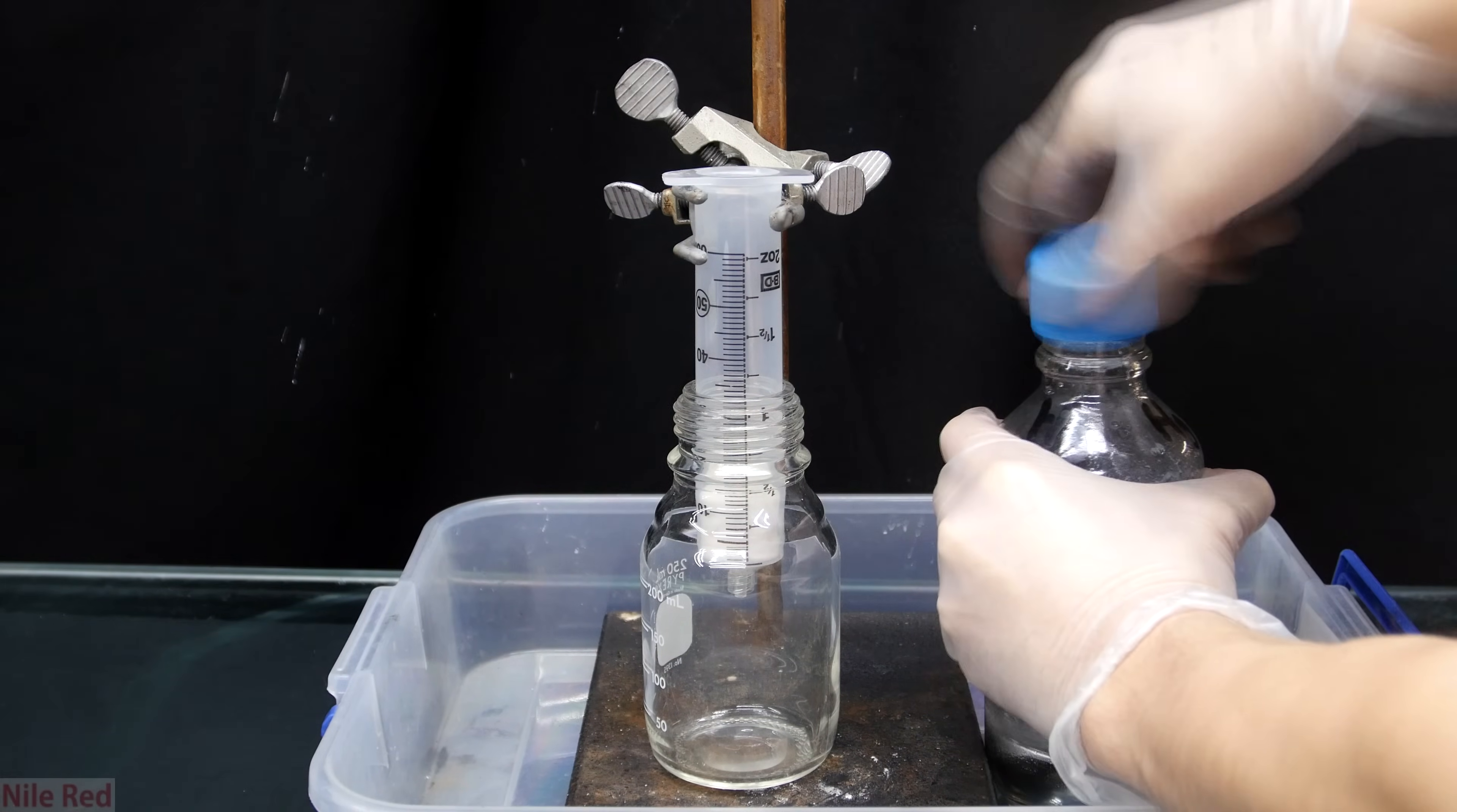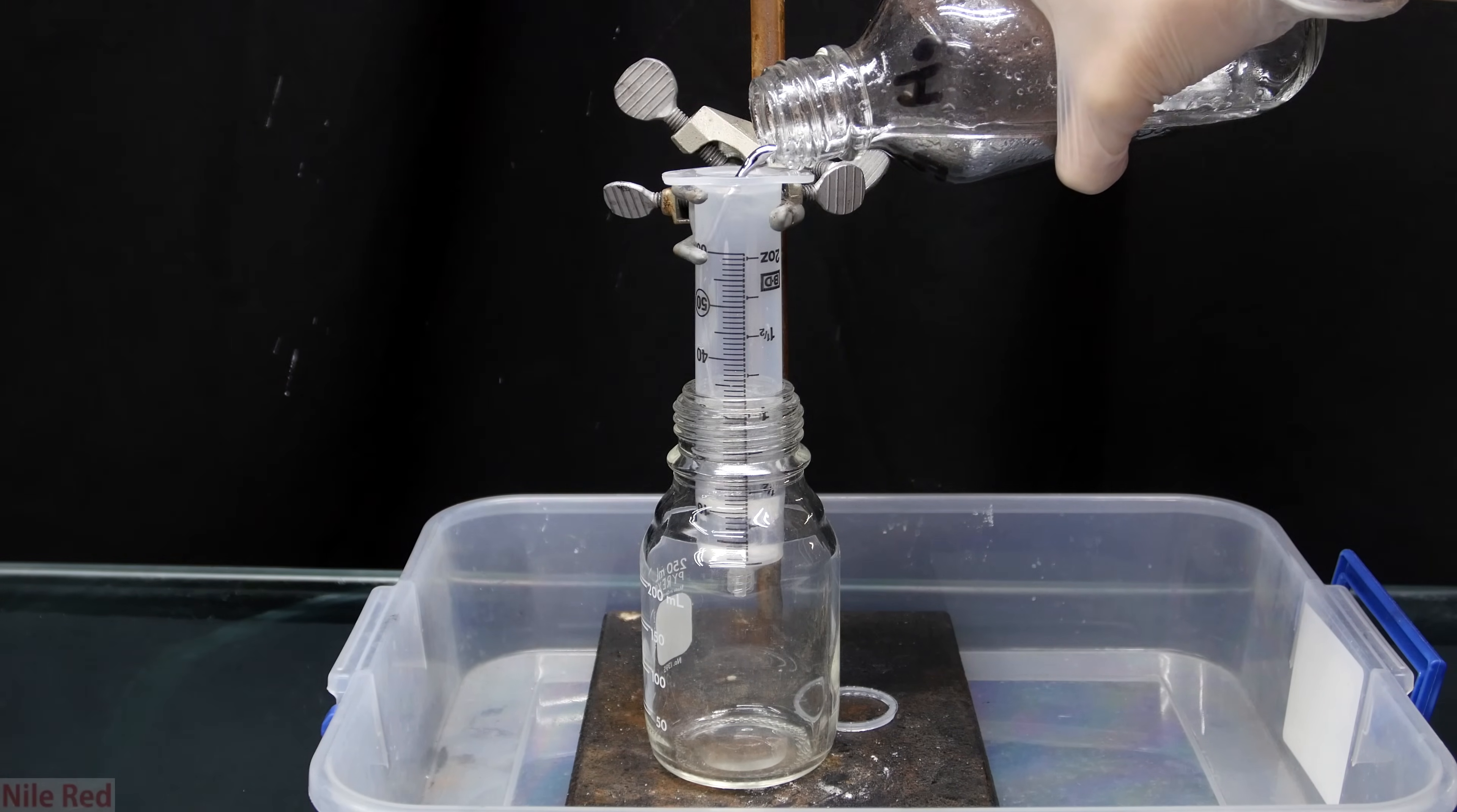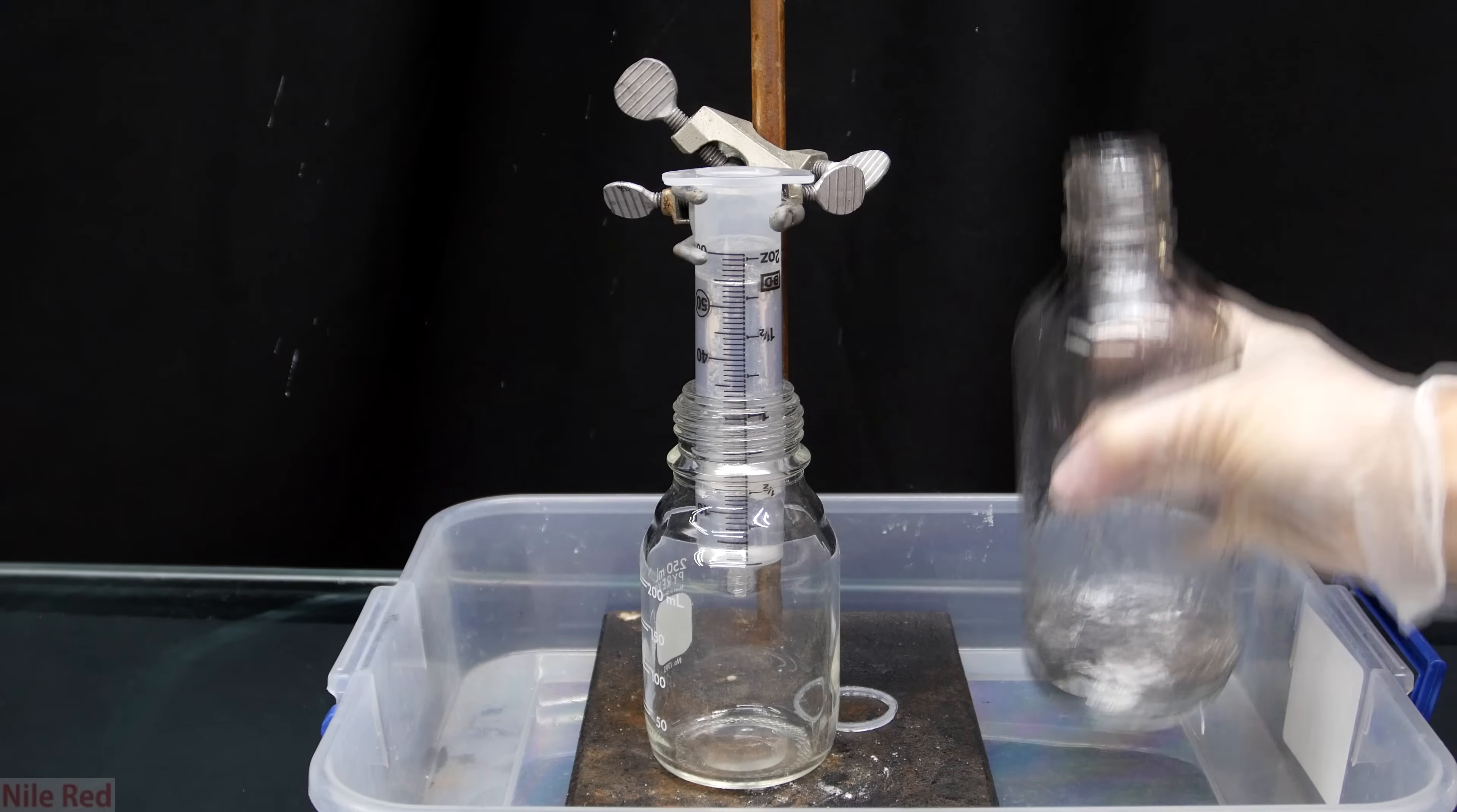When I'm ready I open my mercury bottle and I start to pour it into the syringe. When you pour it in it's important to be careful because you don't want to miss the syringe and have mercury splash everywhere. Also if you pour it in too quickly the mercury is heavy enough that it can displace your cotton filters.